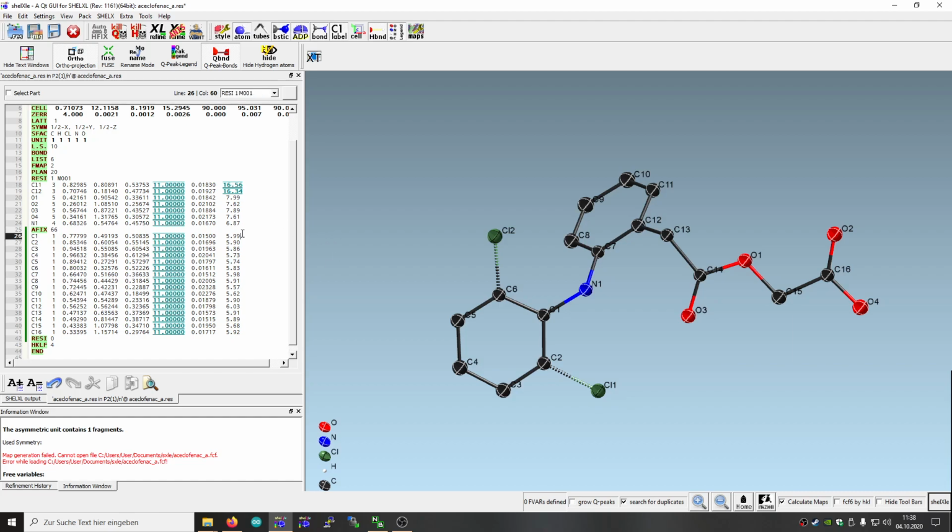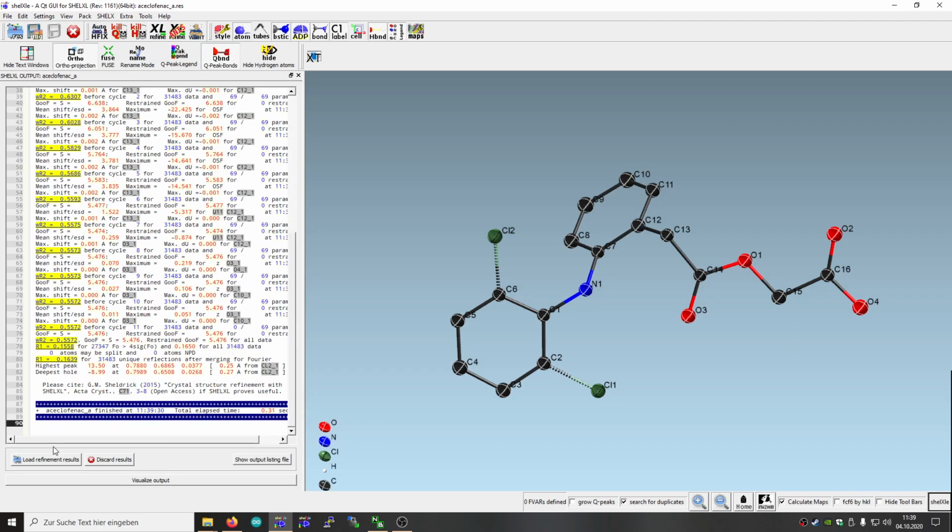And this means that the next 6 atoms should be in the geometry of a phenyl ring, and as we have 2 of them, I just put another AFIX 66 here, and I have to close this AFIX in by AFIX 0. Like this, and I just define that.